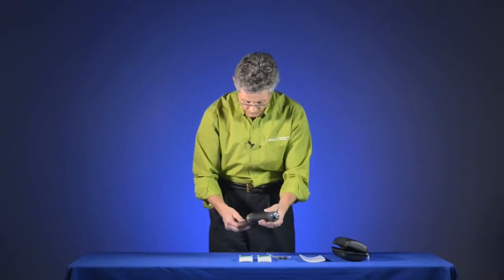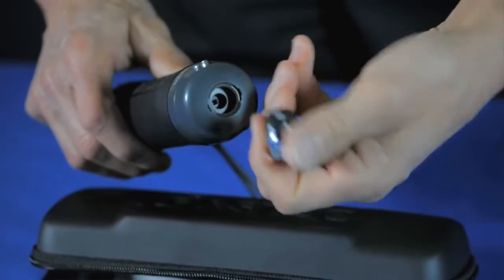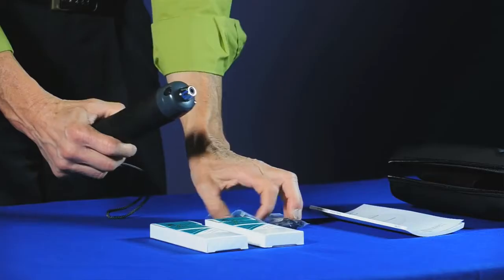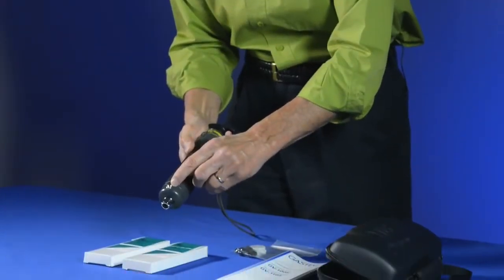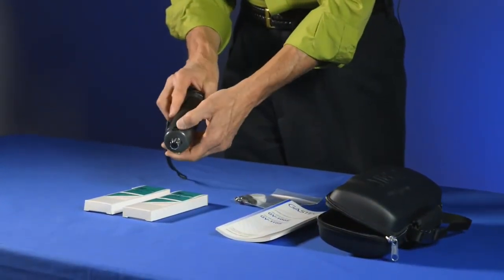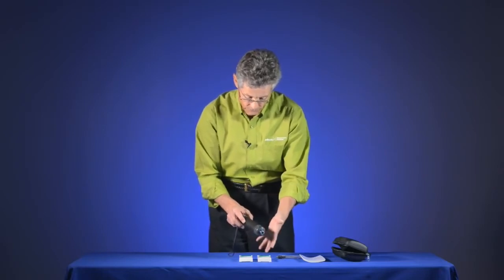The pump itself is comprised of several different parts. At the front end is the actual sampling tip where we insert the tubes, and there's a little rubber flange in there. The maintenance kit has replacement rubber flanges in case you need those. There's also a tip breaker at the end used to snap off the ends of the detector tubes, as well as a little cover to remove any bits of tips that are left over.